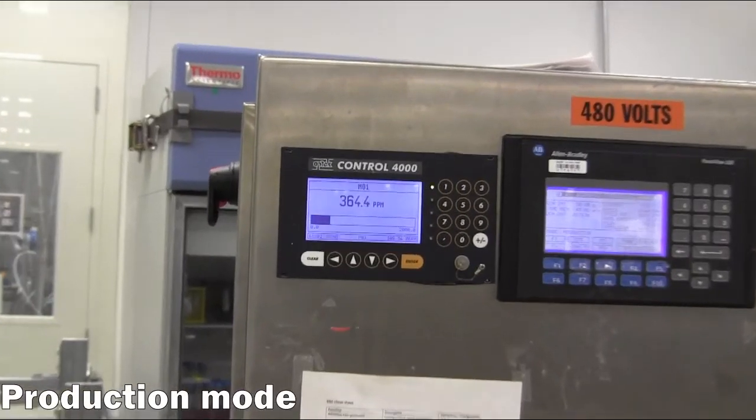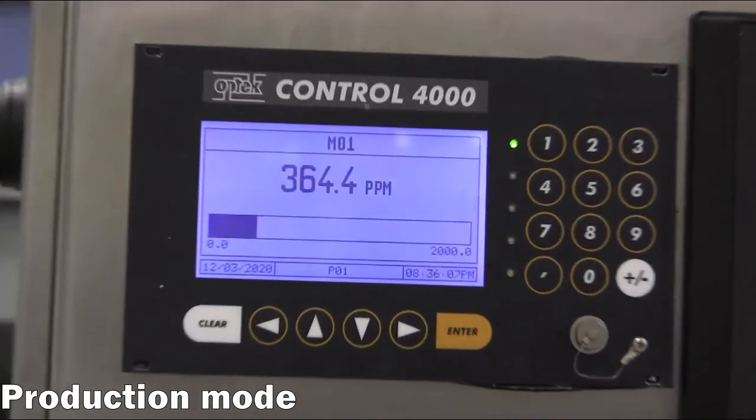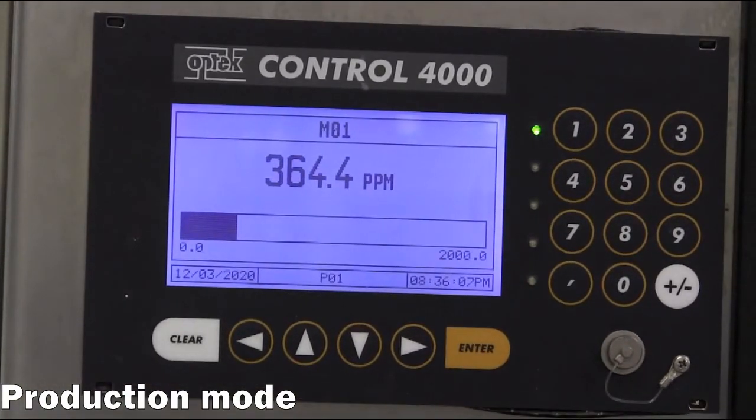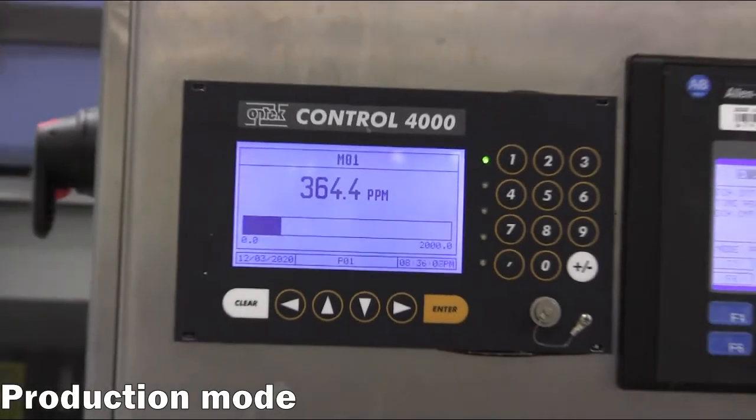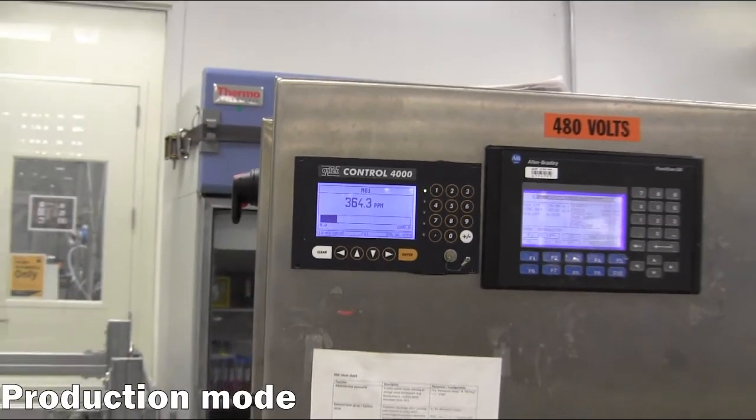To the left of the control panel is a display for the turbidity sensor that monitors the clarified liquid line. The measured turbidity value may gradually increase between discharge cycles, indicating an increase in cell carryover as the bowl volume decreases due to sludge accumulation. A rapid spike in the turbidity value indicates the bowl is saturated with sludge and that an immediate discharge is required to reset the separation.